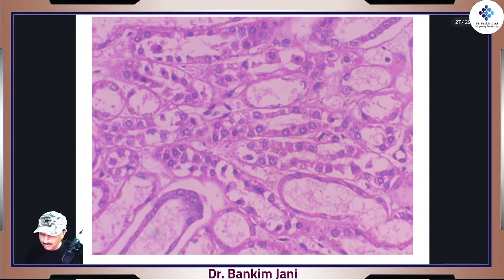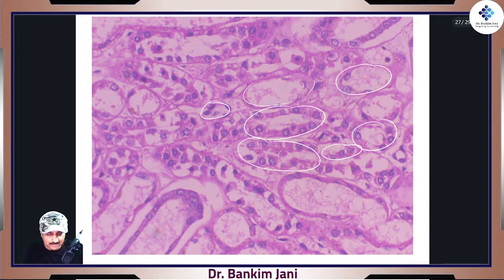See, this is one. This is one. This is another. This one is there. Here it is. Here it is. Here it is. So many. Suddenly we start watching so many collecting ducts.